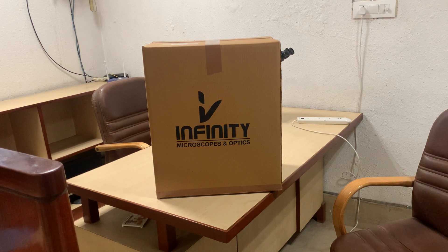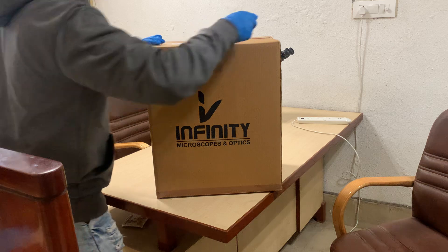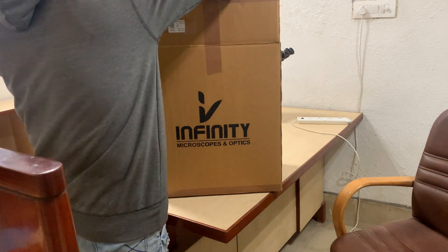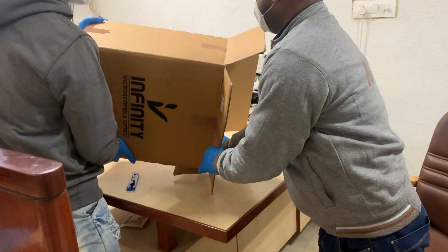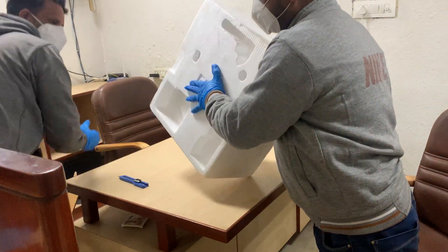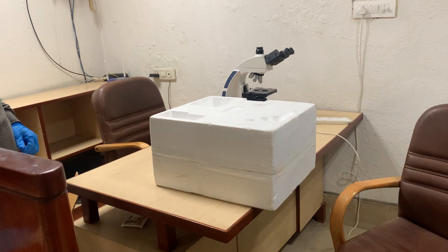This is the unboxing and installation video of the IOX 7 Delta microscope from Infinity Microscopes and Optics. It will be packed in a corrugated box with further packing of a thermocol box so that the microscope reaches the customer easily and safely.